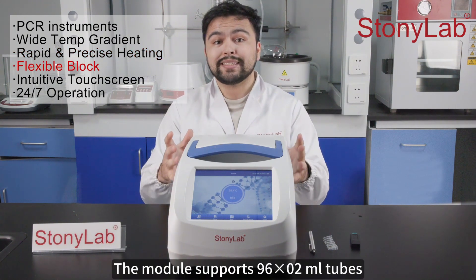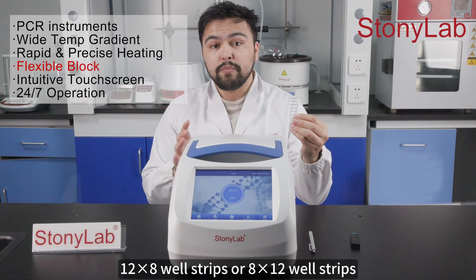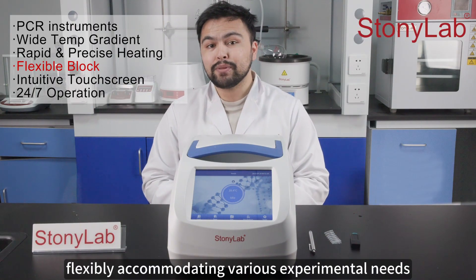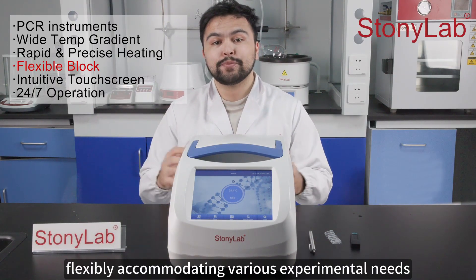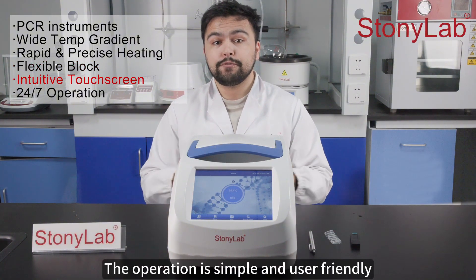The module supports 96 by 0.2 milliliter tubes, 12 by 8 well strips or 8 by 12 well strips, flexibly accommodating various experimental needs.